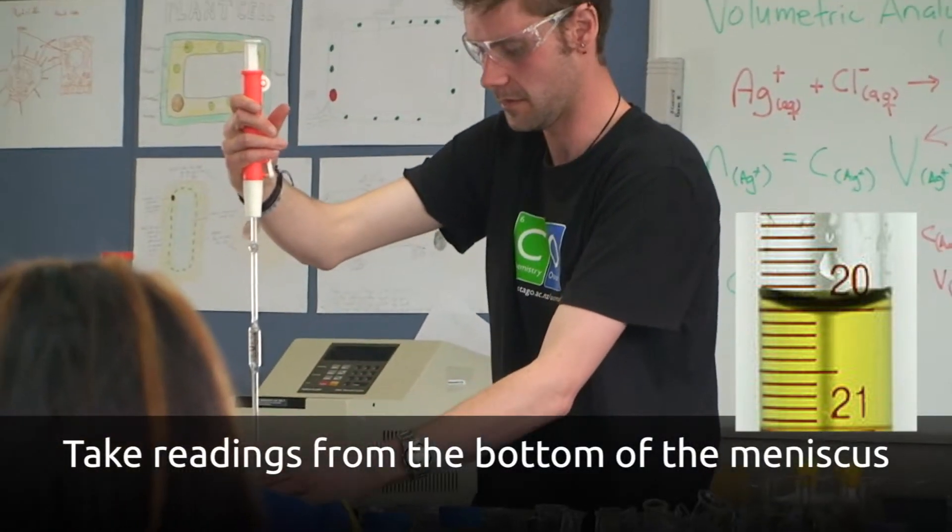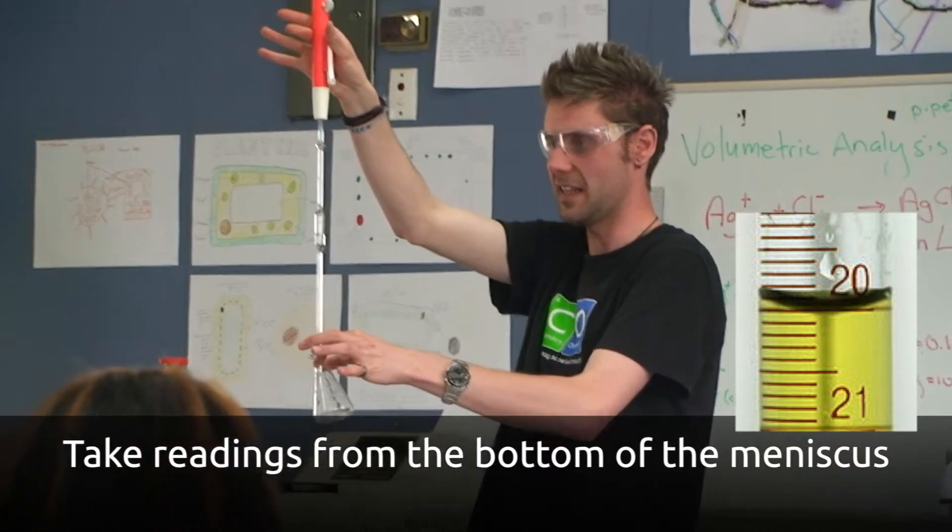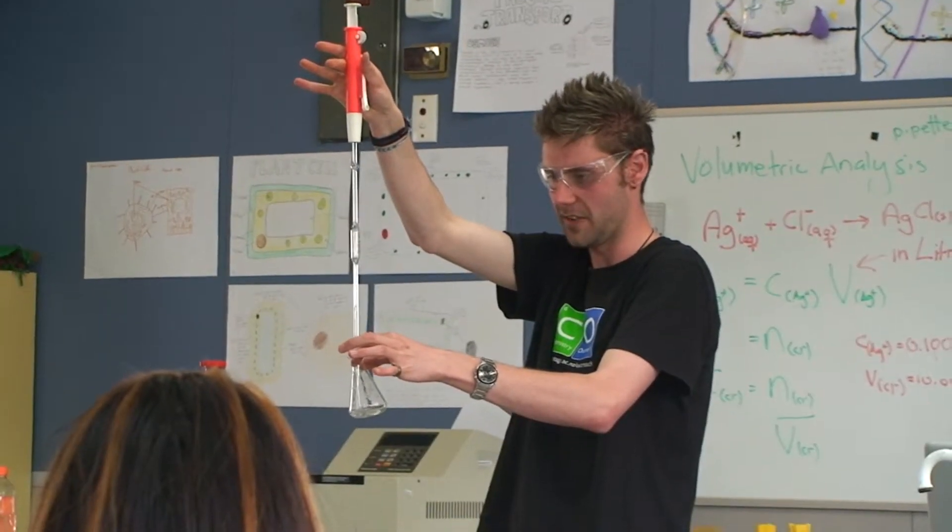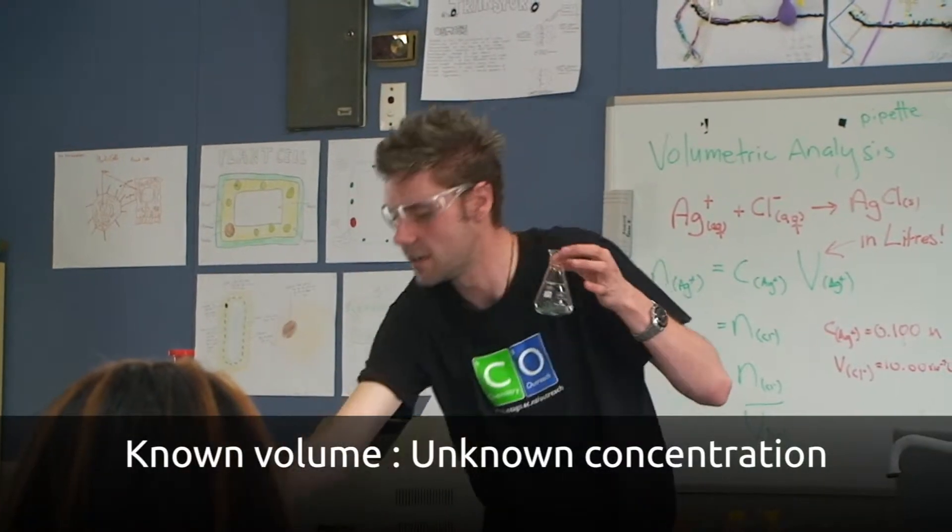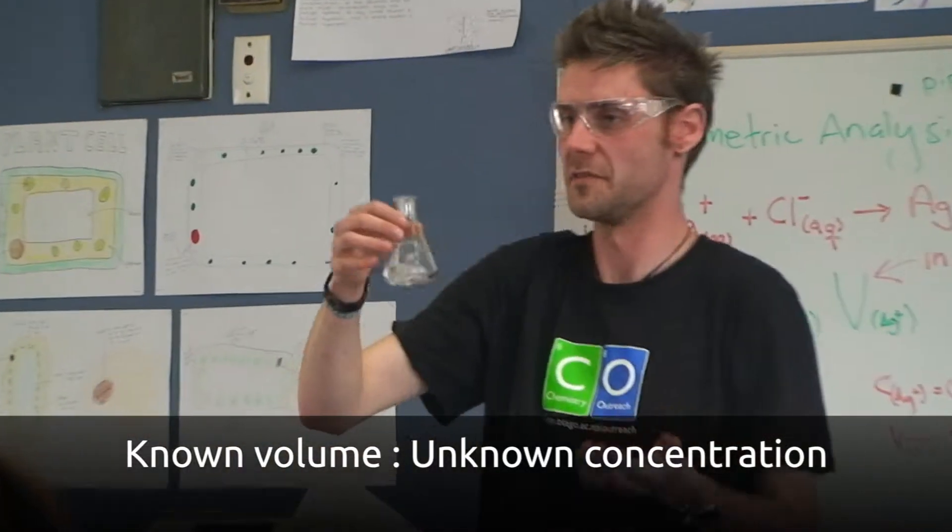So then you can empty it in here. Pull that lever, release the vacuum, and it flows into the flask. And so in here, I have exactly 10 milliliters of seawater.